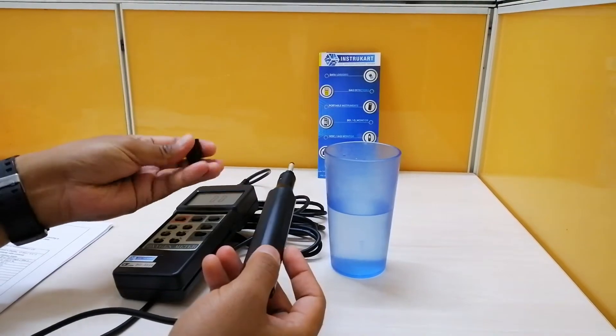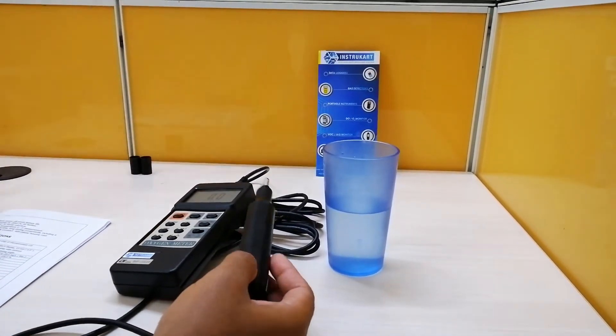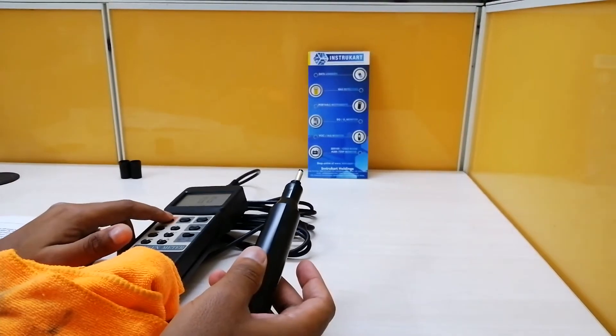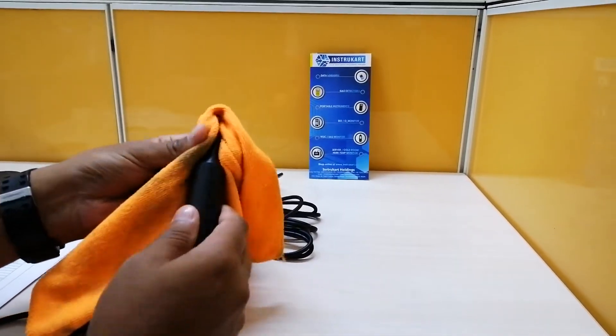For the oxygen in air measurement, we need to do some preparation. First, we have to clean the probe thoroughly. I'll switch the instrument off and clean the probe very well.